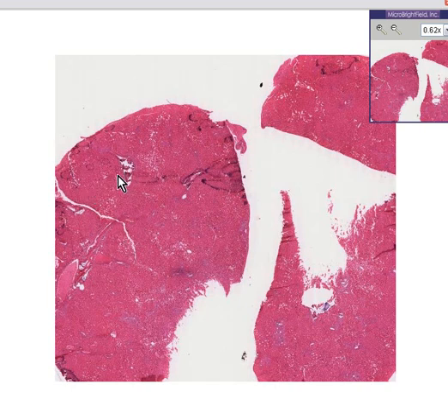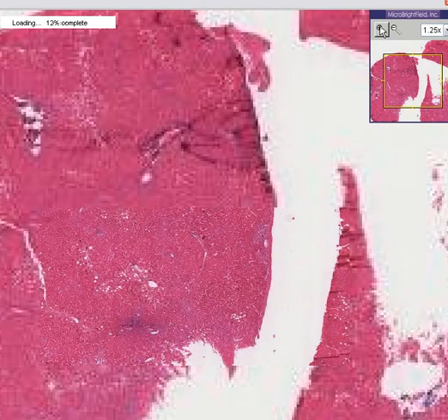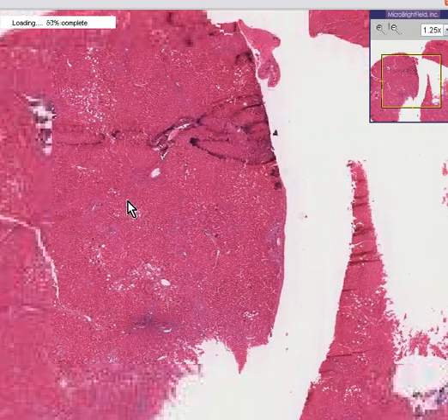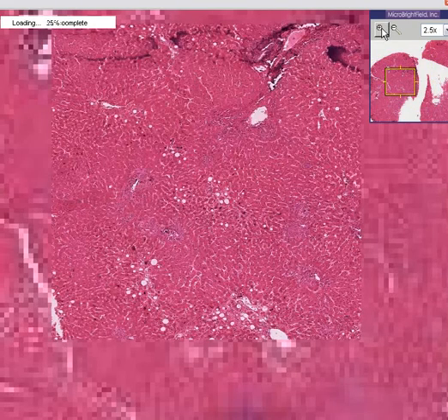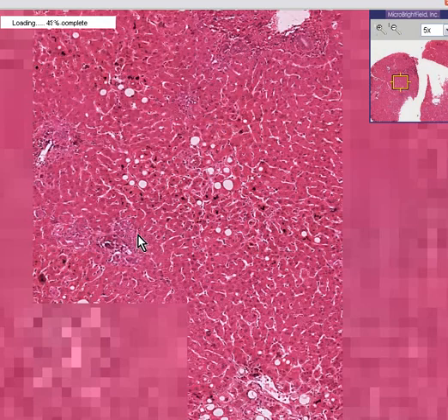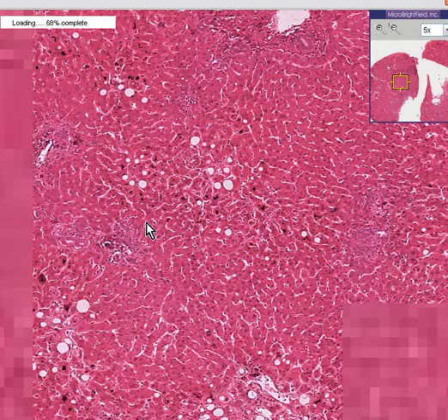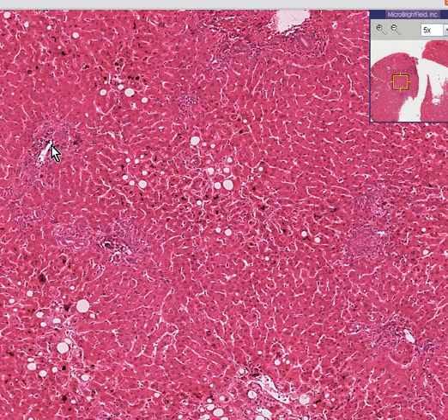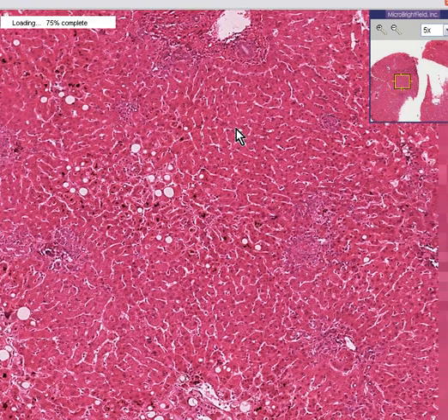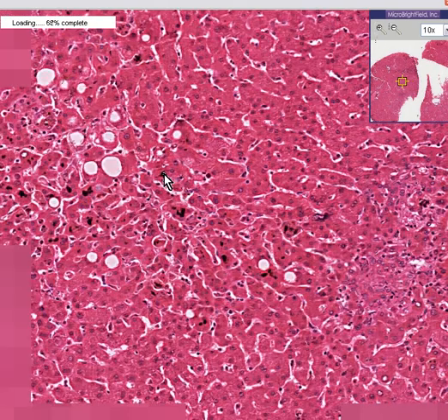What do we have here? We have something red. Let's blow it up a little bit. I think very soon you will be able to recognize that this red tissue, by virtue of having portal areas here and here and here and here, and little cord-like cells between them, is liver.